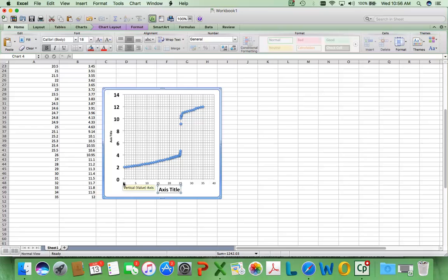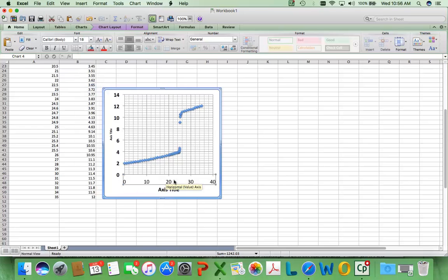When you're making your charts and your plots, for presentation you definitely want to make sure that your font is bold and big enough for people to read. Often I use 18-point font. It's good. Now we also want to label our axes. So on my x-axis it's volume titrant added in milliliter units. That's what we plot down there. Make sure my caps are good.